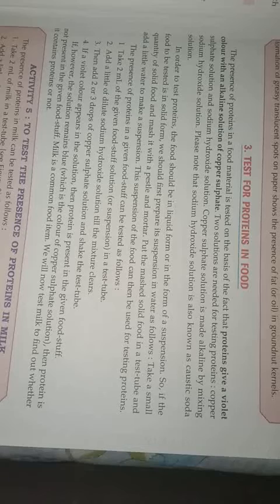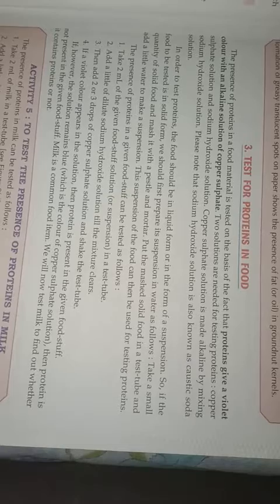Morning class 6. In the previous class we studied how to test for the presence of carbohydrate and fat in our food. Today we are going to learn how to test for the protein present in our food. So let's begin with our topic.